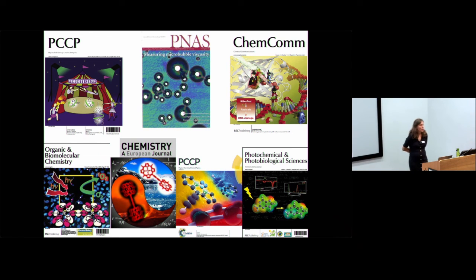That's a really good question. So we understand how viscosity values correlate to diffusion in membranes, because early on, when we first developed this method, we needed to do lots of control measurements to persuade others that we're measuring the right values. Basically, our viscosities translate into diffusion coefficients that people would expect from a particular viscosity value for a particular size of solutes. So they have a really meaningful value to them.